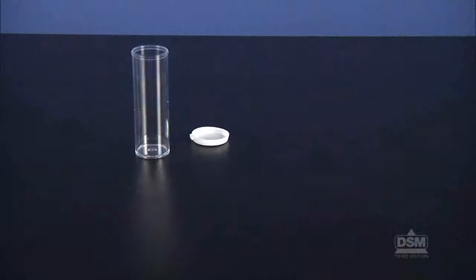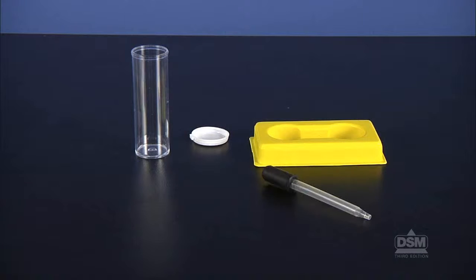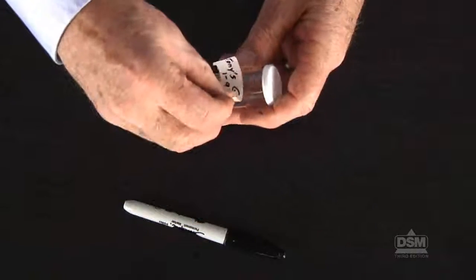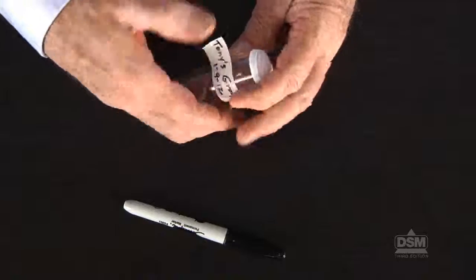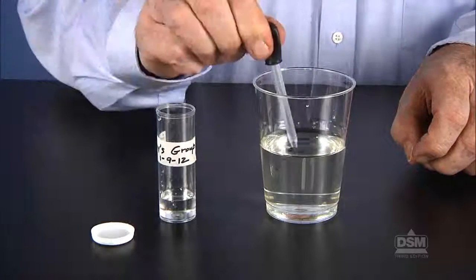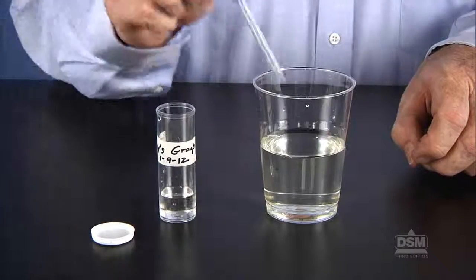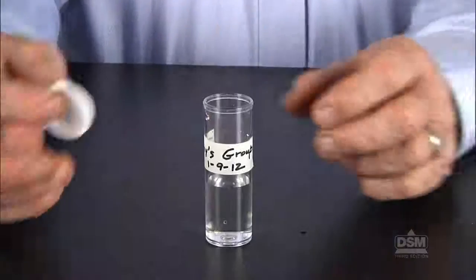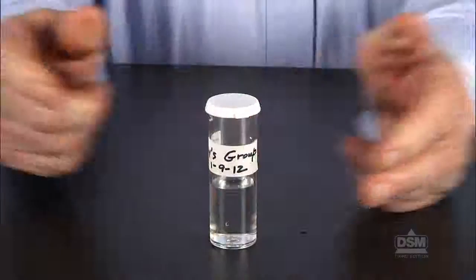Next, distribute a vial with a cap, a vial holder, a dropper, a piece of masking tape, and a marker to each team of 2. Have each team set up a Daphnia population in a vial. They should first label their vial with their names and today's date. Instruct students to use their droppers to fill the vial half full of the Daphnia water from the container. Add 5 Daphnia, and then place the cap firmly on the vial.